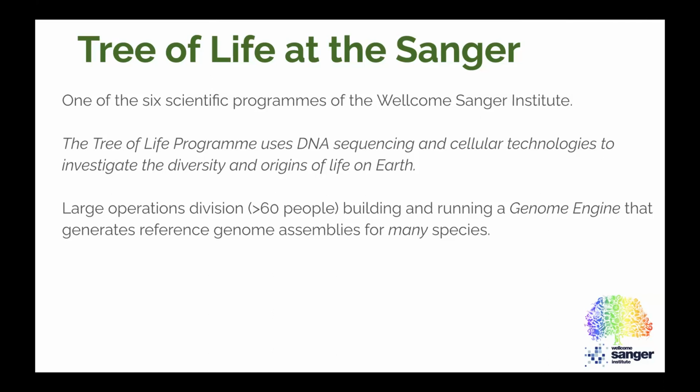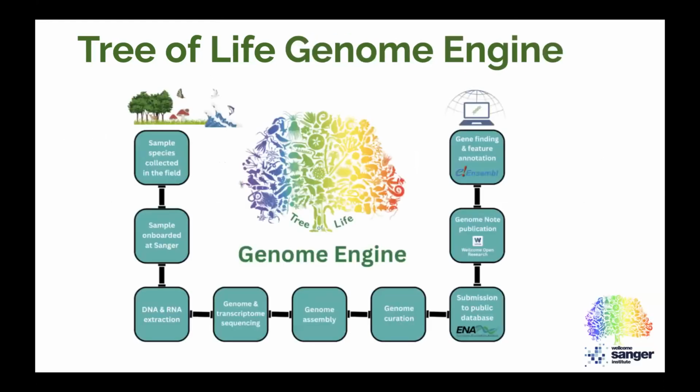We actually want to be generating a few thousand genomes every year. And those are all novel species, and that's a difficulty because no one has ever tried sequencing and assembling the species, and there are a lot of issues. So that's the overview of the genome engine.